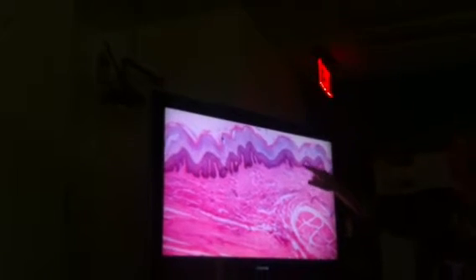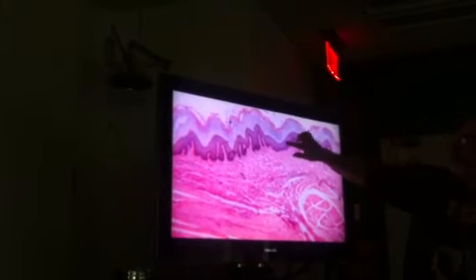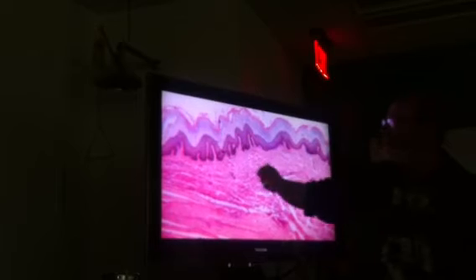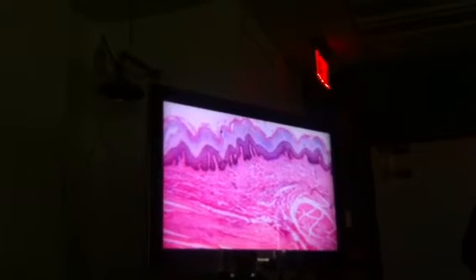We've got markers up through this. They coil at the base, and then there's kind of one tubule that will come up and exit out into the exterior. You can see the pigmented melanocyte layer there, which is actually part of the stratum basale. You can see the nice stratum spinosum. You can see the granulation starting in the stratum granulosum, and then you can see the stratum corneum up very nicely up here. This does actually have a stratum lucidum, that little pink there, but it's very hard to see in this preparation. The papillary dermis is where these little finger-like things are sticking up.